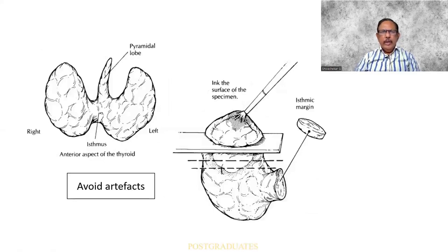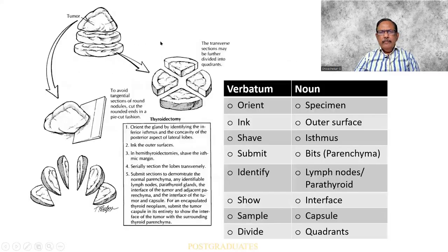So when I am in two minds with a seesawing cut, there will be knife marks and the surface that you get on the tissue will not be uniform. Therefore, it has to be a single deliberate cut with a lancet blade probably. So this is how it is being cut and then it is oriented and mounted.